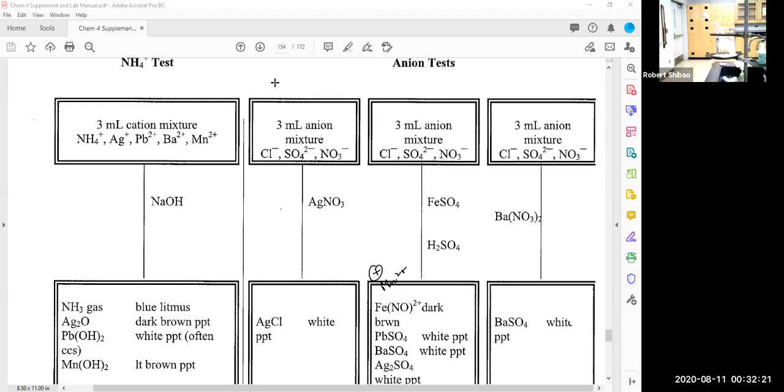And this sodium hydroxide is 1 molar. I think I had some 6 molar sodium hydroxide, a bit more concentrated. So let me find that 6 molar sodium hydroxide. Maybe not. I don't see it. Oh, there it is. Okay, so here's my 6 molar with the etched glass. And how much do we want? We want lots. We want to make sure there's plenty enough to react with all of it.